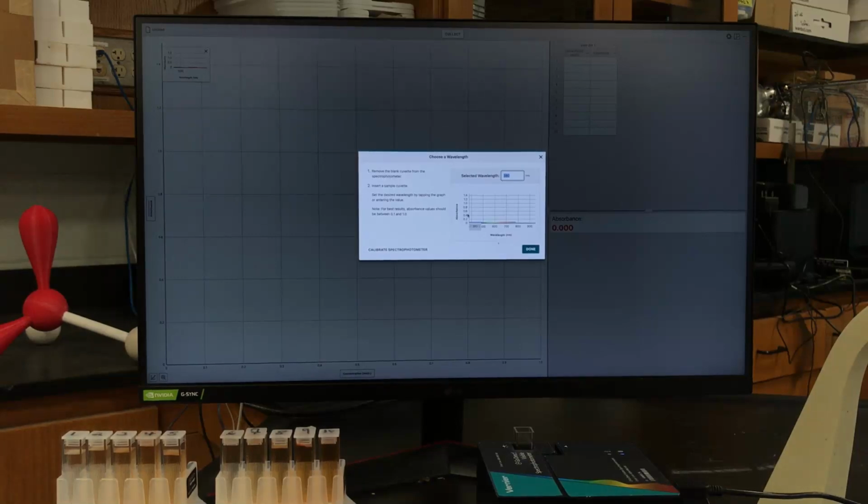So we're going to collect data for the iron thiocyanate lab given by Flynn, and we have our reference solutions here and our test solutions here, and we're going to make a Beer's law graph here. I'm using the Vernier Go Direct Visible Spectrophotometer, and a really important part of this lab, as in any spectrophotometry, is that we want to essentially set the spectrophotometer to look for a particular wavelength that this colored chemical has, a color, of course, because it's absorbing part of the visible spectrum of light.